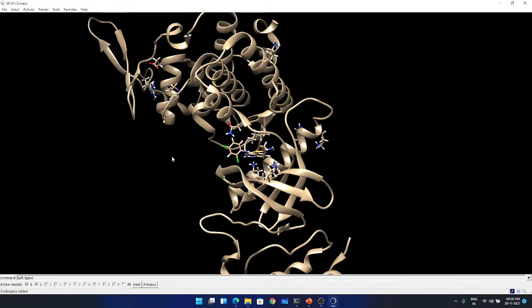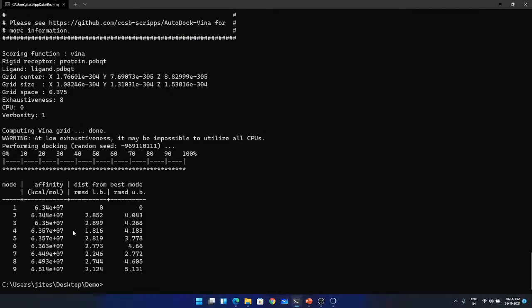The results were messed up because Vina 2 uses 0.375 grid spacing by default. Well, the spacing should not be a problem. The problem came because I did not add the hydrogens initially. That is where the problem came from.